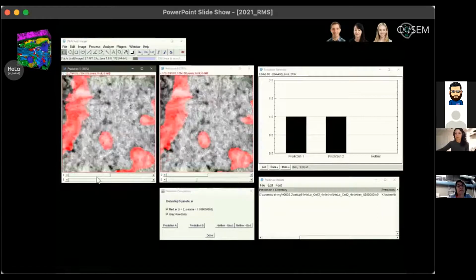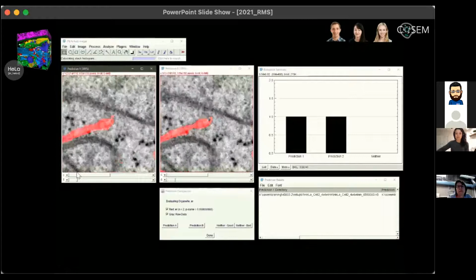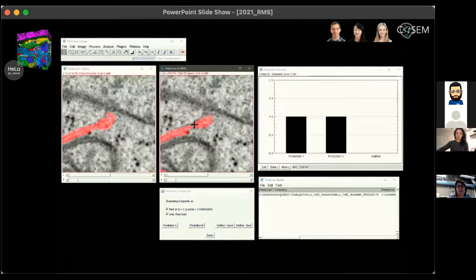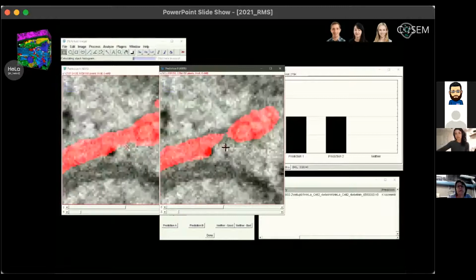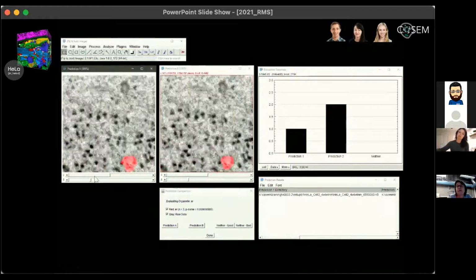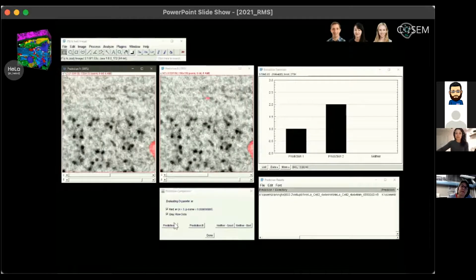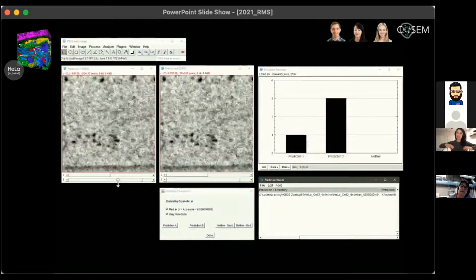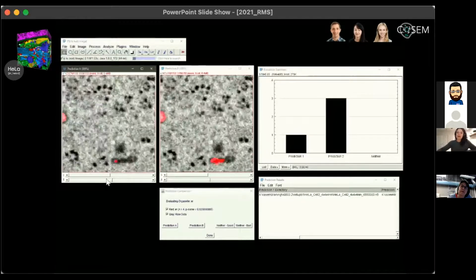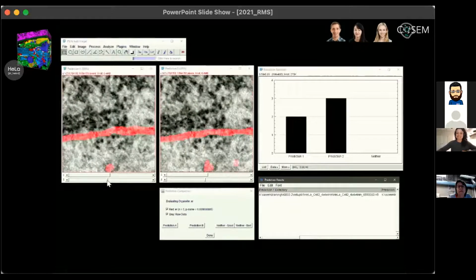This evaluation process then repeats for a new crop, and the evaluations are performed until, after a minimum of 100 evaluations, we reject the null hypothesis, and the network that performed best is deemed the winner. We don't allow any ties; we force a decision to be made. We use this manual evaluation to back up the conclusion that we reached with the automatic validations, and that is that most of the time, the combined networks, so training on all 37 classes at once, seem to perform better than when we just train on 1 class at a time. So the more information, the better, was the takeaway.